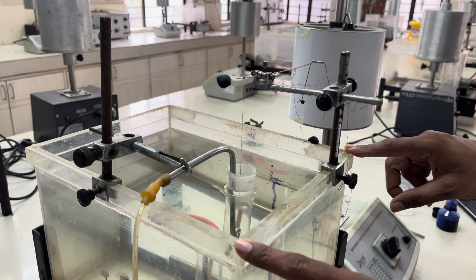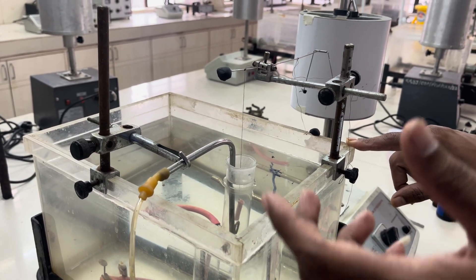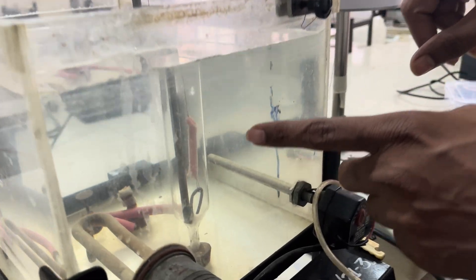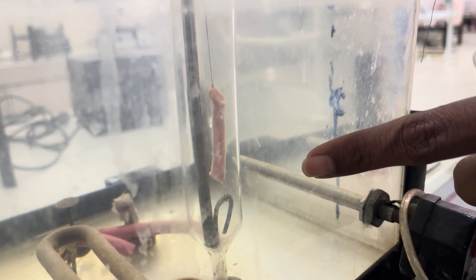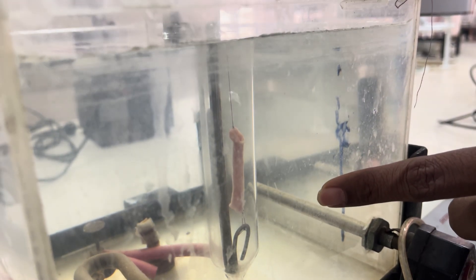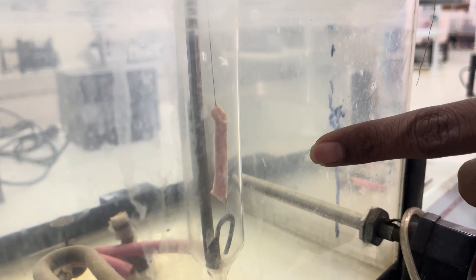First, you have to take the muscle. The muscle is tied to the muscle holder, as shown here, and it is attached to the aerator. You can observe that the bubbles are slowly going in an upward direction, which will provide oxygen to the tissue.